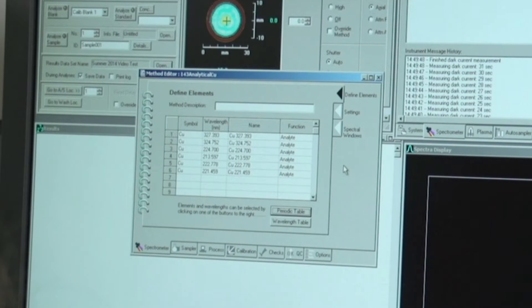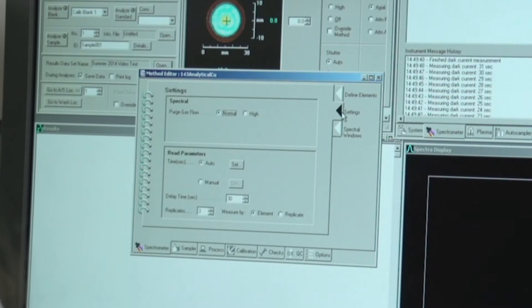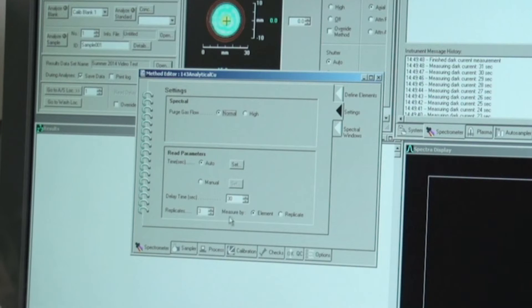Once you've exited the periodic table, all the wavelengths associated with copper will be in the table. In the method editor under the spectrometer tab, go to the settings tab. Make sure the delay time is set to 30 seconds, that replicates are set to 3, and that measure by is checked for element.